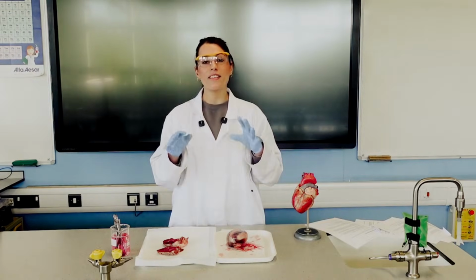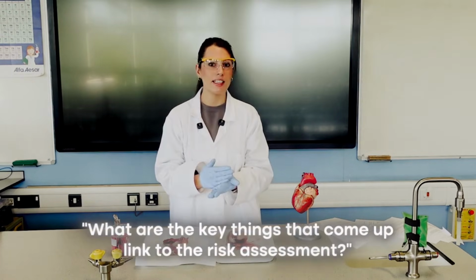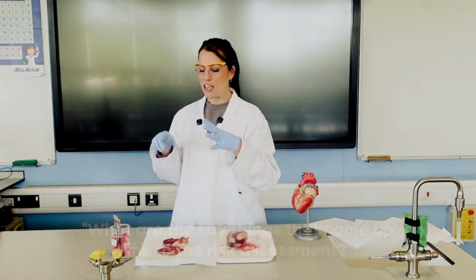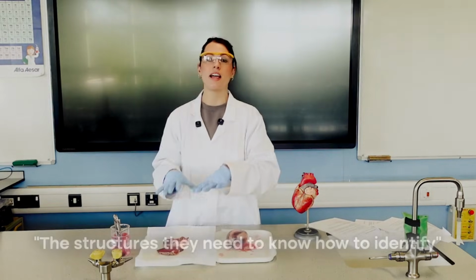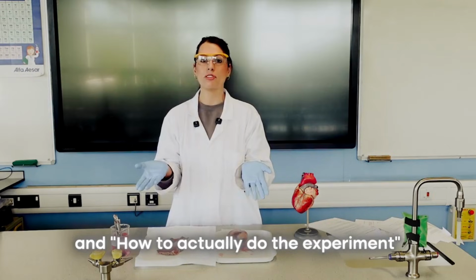Hopefully you found this video helpful, so you now know what to point out to your students, what are the key things that come up linked to the risk assessment, the structures they need to know how to identify, and how to actually do the experiment to show the students in advance or for them to use as part of their prep.